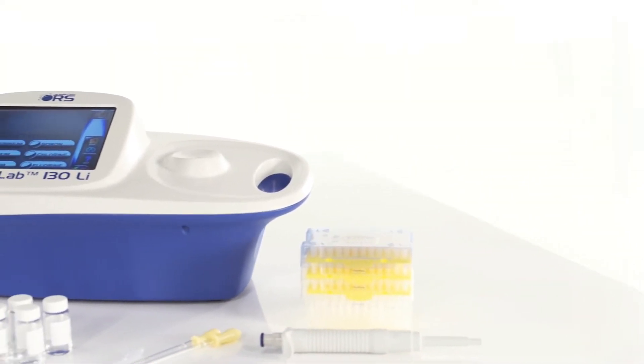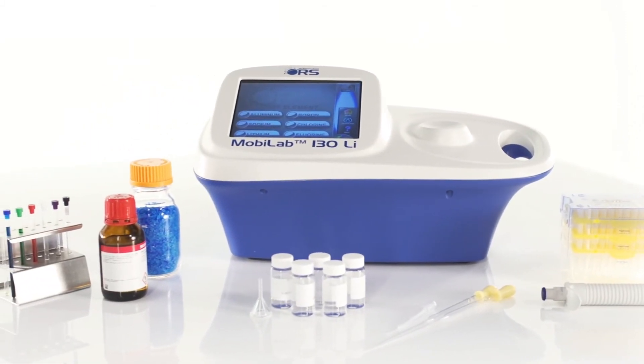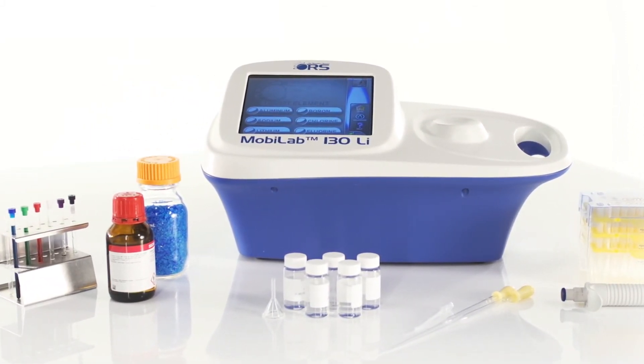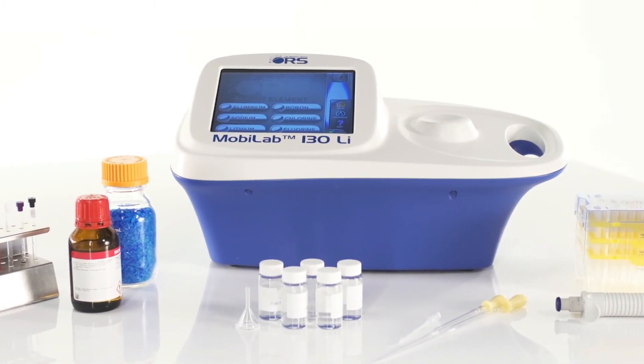Receive a fast return on your investment while putting the highest quality magnetic resonance technology at your fingertips. Test easily and with accuracy. Use the MobileLab 130, then take the industry's leading chemical analysis device with you.